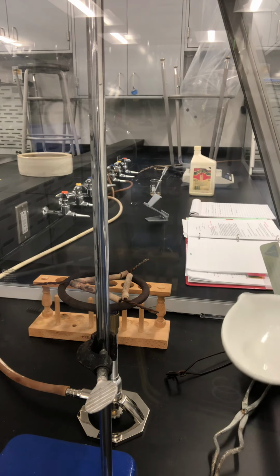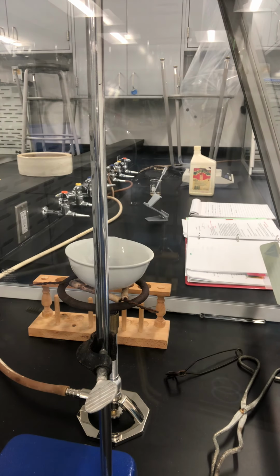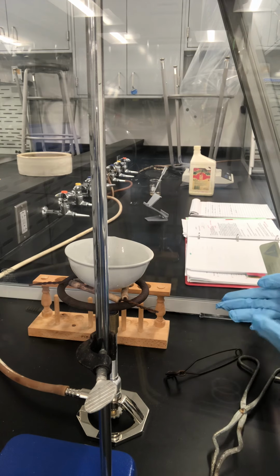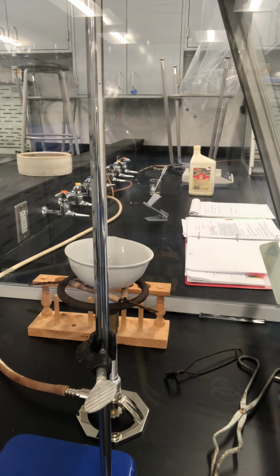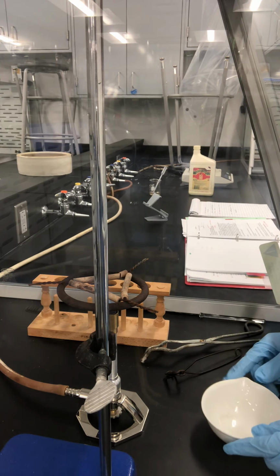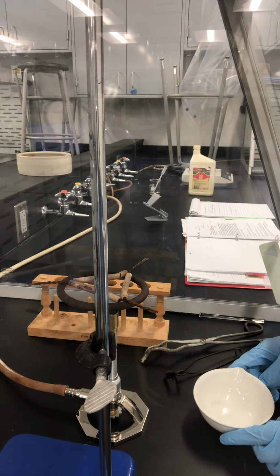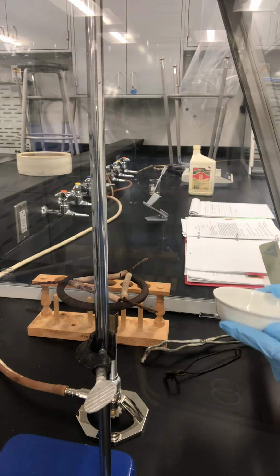Step 2, you need to heat this evaporating dish on the burner, after we wash it with soap and water. And I already did that. And then I let the evaporating dish cool down to room temperature. That is step 3.